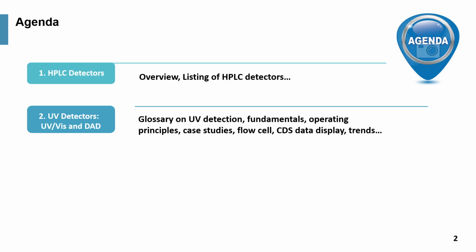Here is my agenda. First, HPLC detector, overview and listing of all the HPLC detectors. Second, UV detector, UV vis and photodiode detectors, glossary, fundamentals, operating principle, case study, flow cells, CDS data display, and trends.